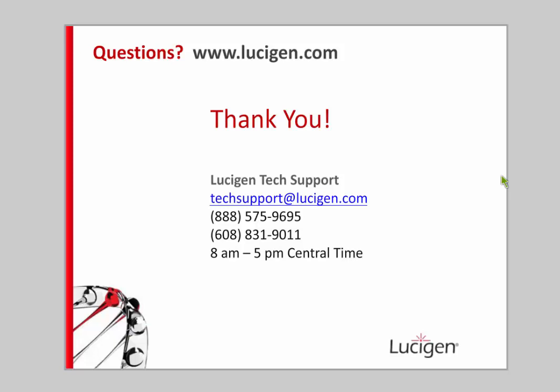Marianne has a question about sonication. What sonication buffer do you use? That is a great question. I don't know off the top of my head. I know that it contains DTT, and I believe it's Tris-based. Those are pretty common combinations. I believe that there is a recommended sonication buffer in our product manuals. But if not, if you want to contact our tech support team, then Karen and our tech support team can help you figure out a good buffer to use. We have some that we use here as a standard basis. And if that information is not in the kit manuals, then we can get it for you.